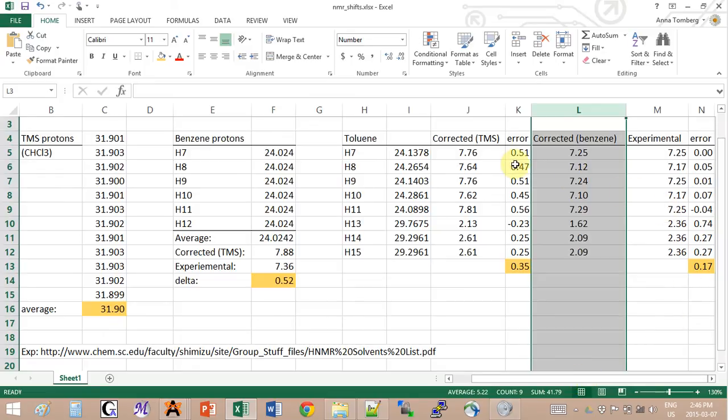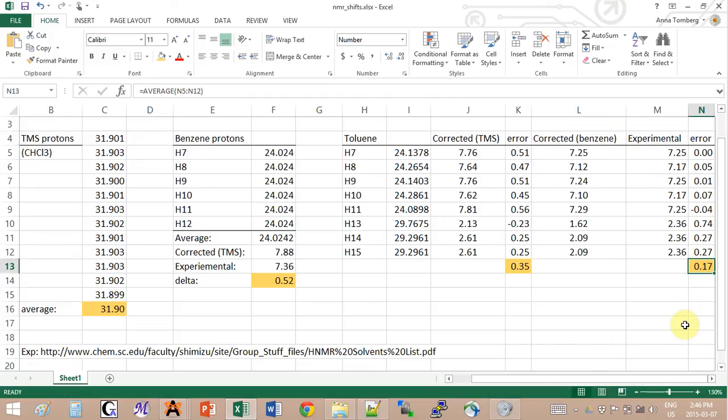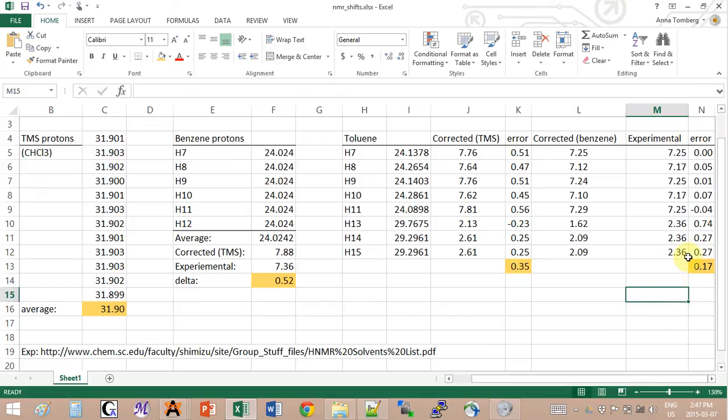And now if you look at the errors, just by doing that, you just reduced the error by half compared to the values that you get non-corrected by the benzene error.